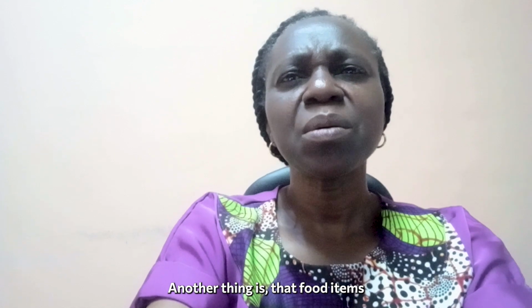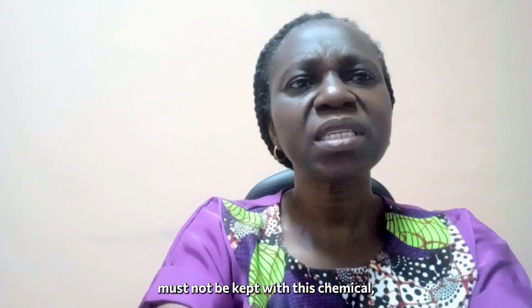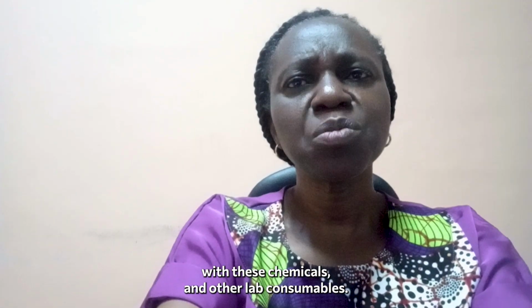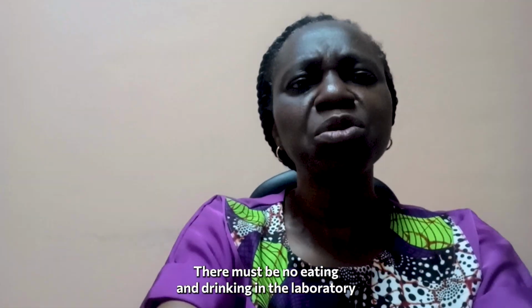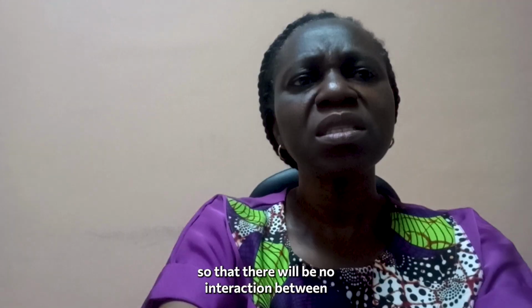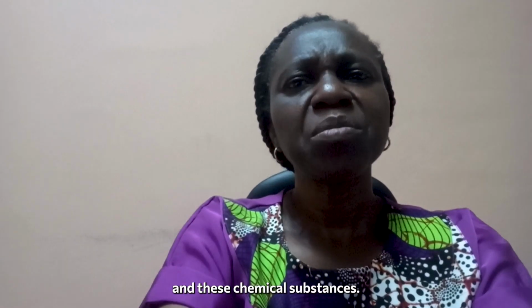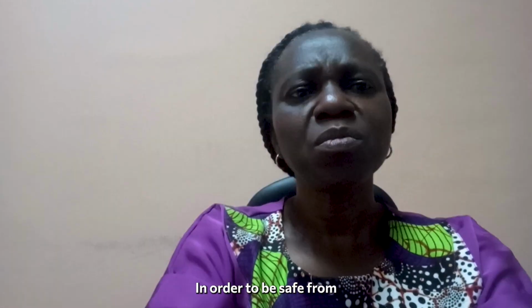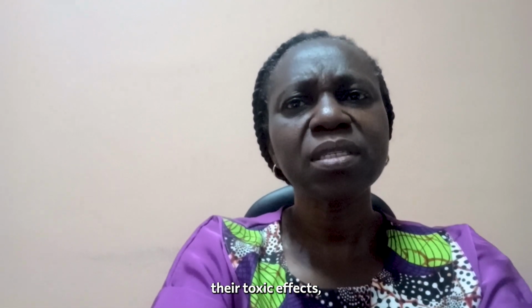Another thing is that food items must not be kept with these chemicals and other lab consumables. There must be no eating and drinking in the laboratory so that there will be no interaction between food and drinks and these chemical substances, in order to be safe from their toxic effects.